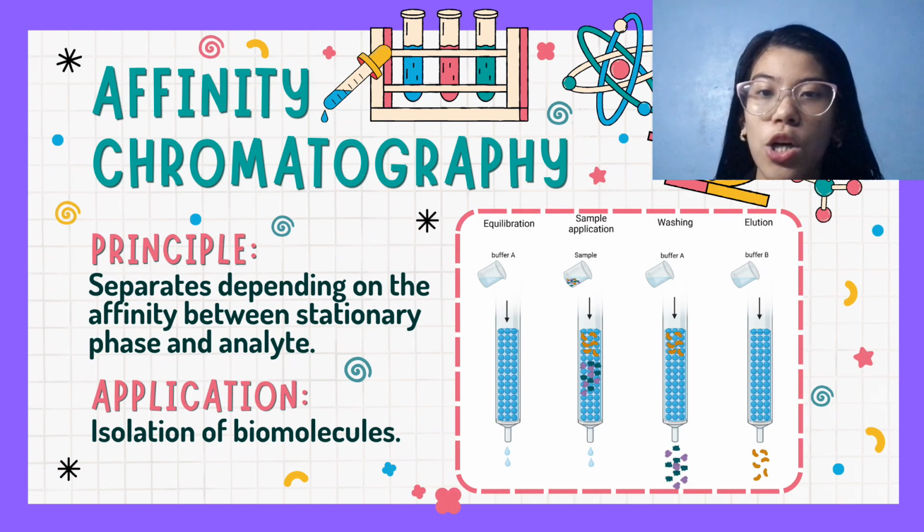Lastly, we have affinity chromatography. This technique separates compounds depending on the specific affinity between the stationary phase and the analyte or the ligand. This method is particularly effective for isolating biomolecules like antibodies or enzymes.